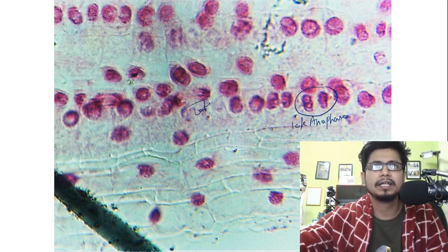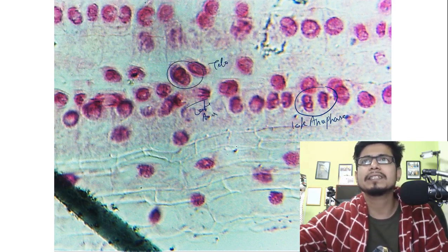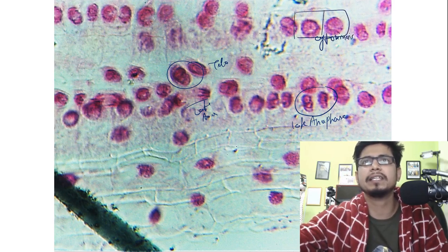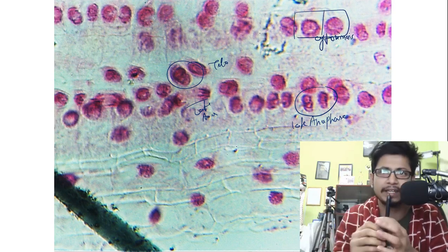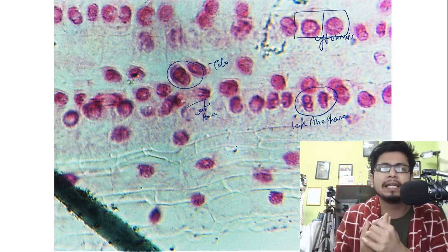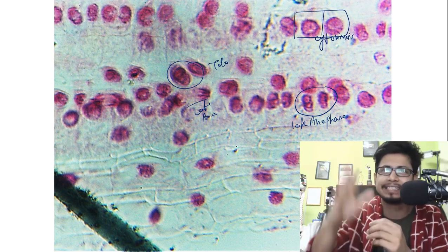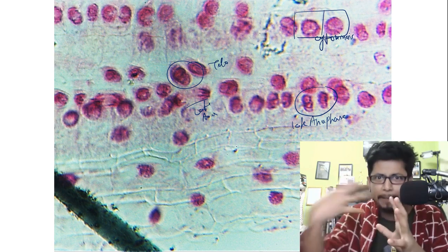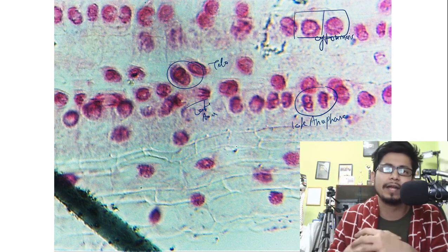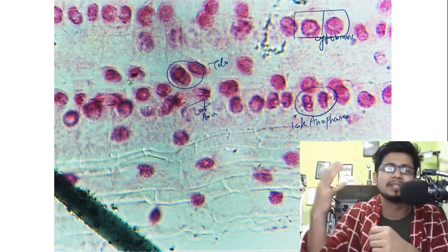This is also late anaphase, and this is cytokinesis. By looking at these pictures you can clearly see all the stages — sometimes the image may not be that clear so you increase the contrast to visualize specific regions. You can clearly see all the different stages of cell division from the root tip of a growing onion. As a researcher, when you see these things happening, it's such a satisfying feeling. From prophase, metaphase, anaphase, telophase, and cytokinesis — all the stages are very clearly visible with this experiment.